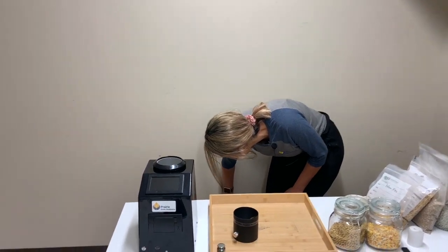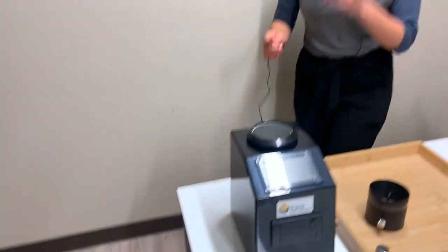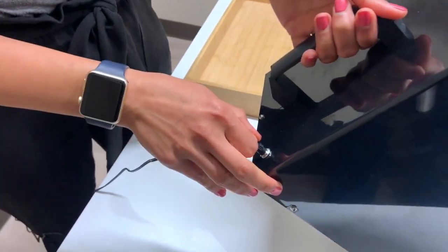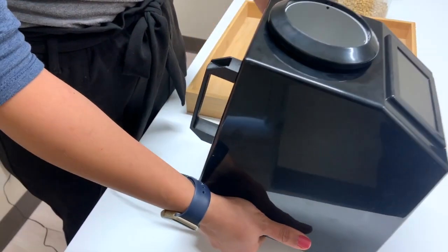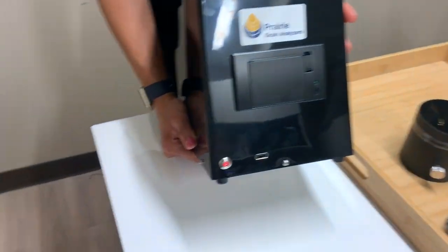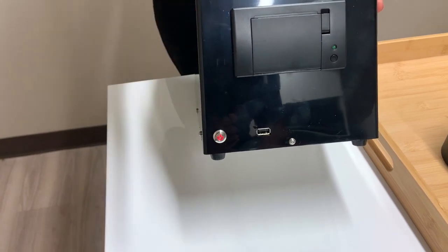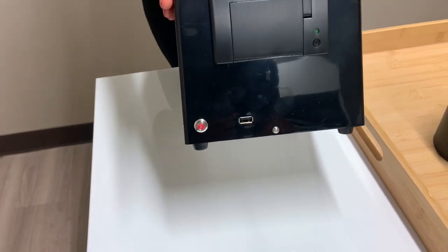You plug it in and the other end will go in the back here. Once you plug it in, the power button should turn red, which means it's actively charging. Once that red color turns off, that means your machine is fully charged.